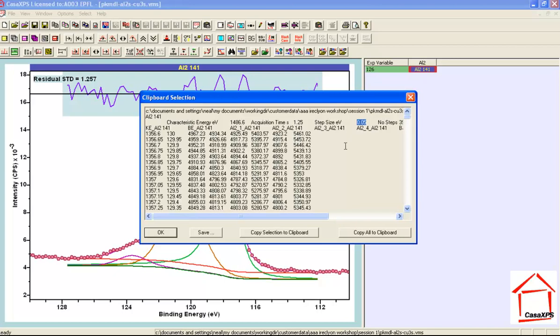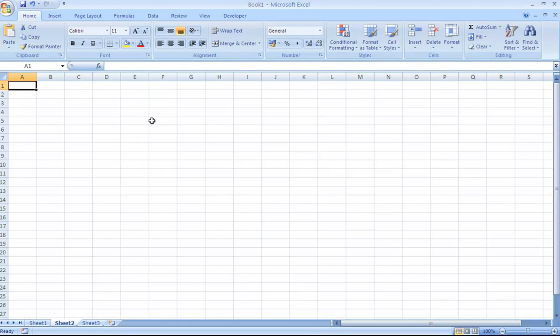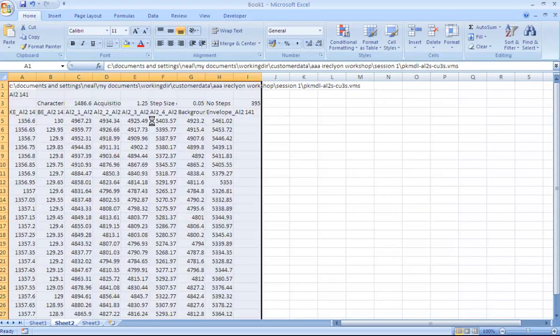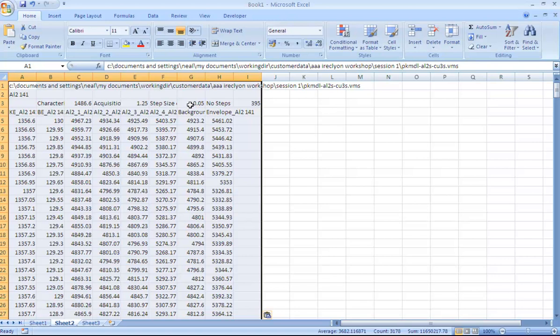So this will provide a set of interpolated data and the synthetic components, the envelope and the backgrounds, all with this resolution. If we take this through the clipboard and enter it into Excel for example, then we get the columns of data listed at a step size of 0.05 eV. So the data itself and the components have all been interpolated to this new step size which is different from the original data size.